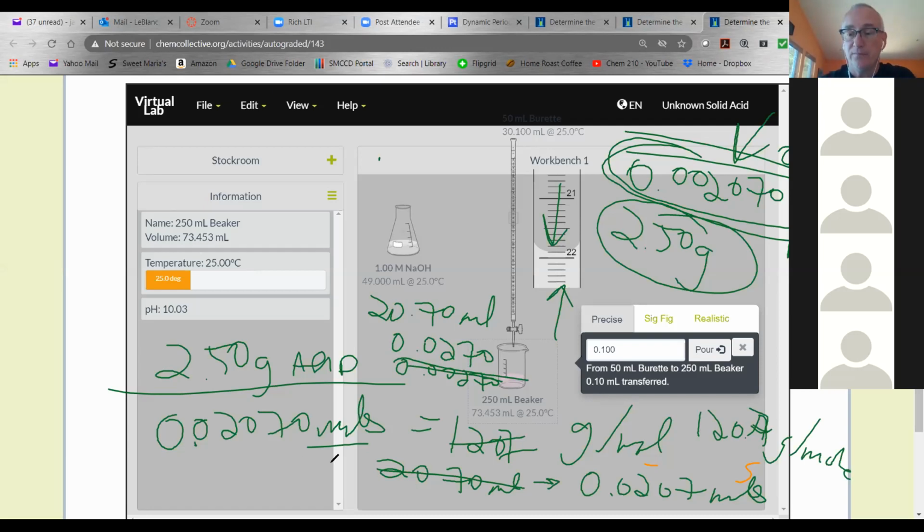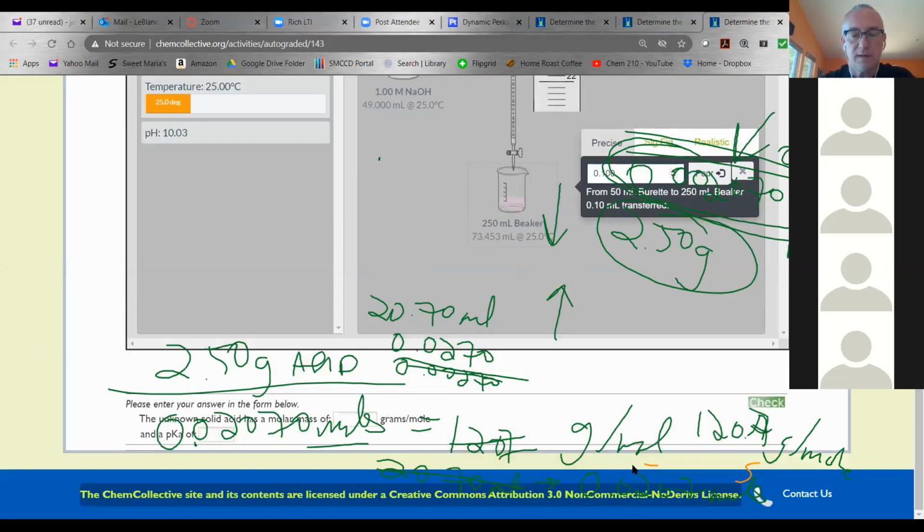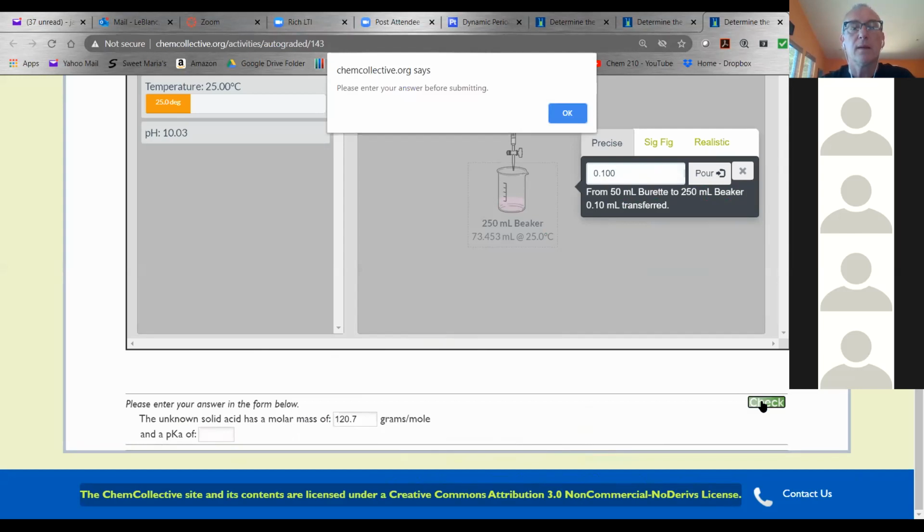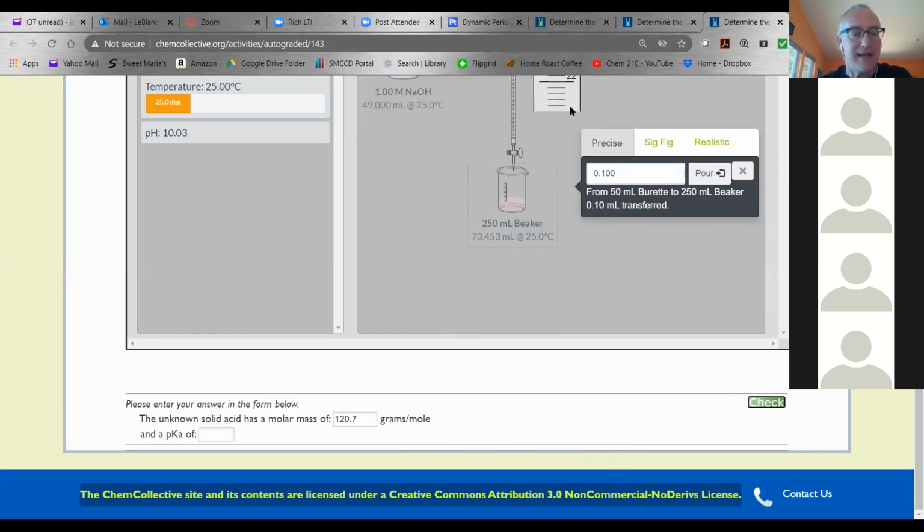So what I can do is come down and actually ask it, is that right? I'm going to clear and say, please enter your answer in the form below. The unknown solid acid has a molar mass of, I'm going to see if we're right, 120.7. Check. Oh, he wants the pKa. I have no idea. We didn't measure the pKa. Well, that sucks. So I guess you have to put the pKa in as well. That's something we didn't talk about.